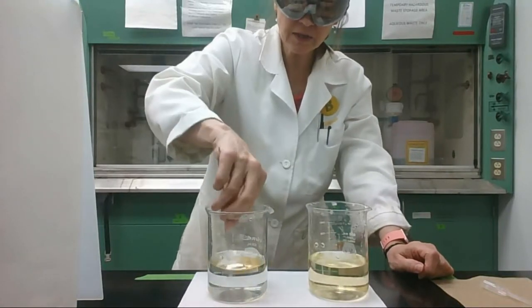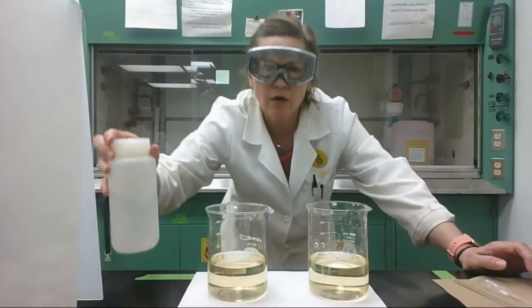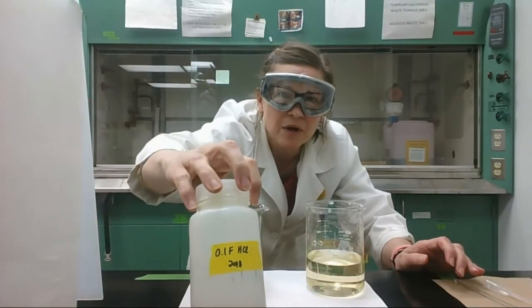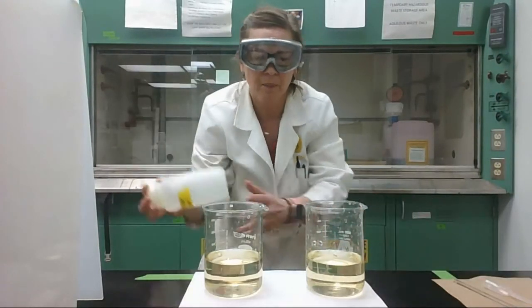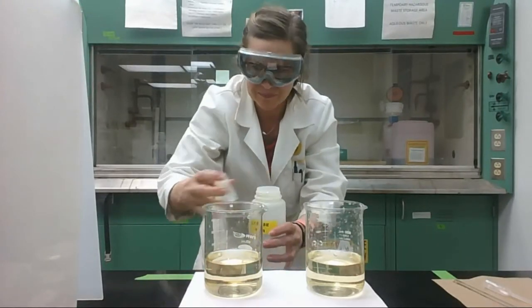So I hope you can see that faint yellow color. I hope it shows up on the camera. And now to each solution, I'm going to add a strong acid. I'm going to add 0.1 formal hydrochloric. Hope you can see it there. And we'll see which solution stays yellow longer.